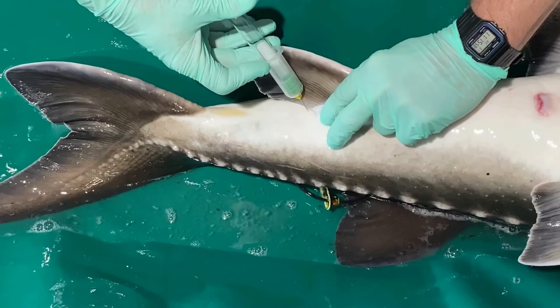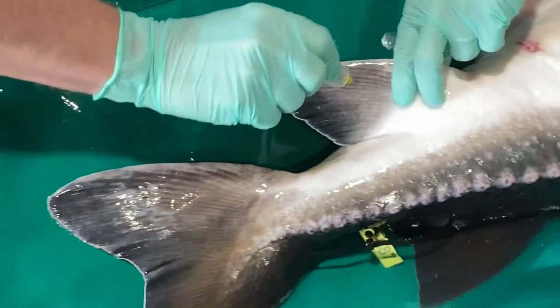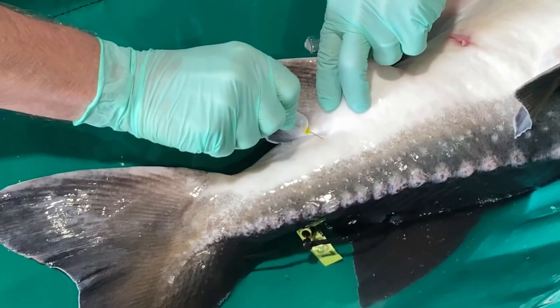Sometimes you will need to slowly and just slightly move the needle up and down or to the left or right to find the caudal vasculature. It is also important to select a needle that is long enough to reach the notochord of the fish you are working with.